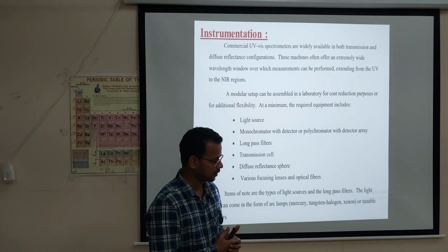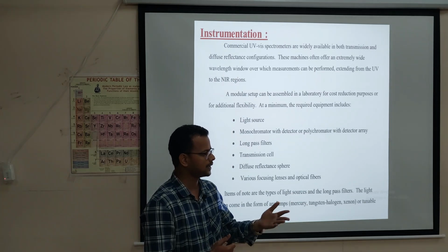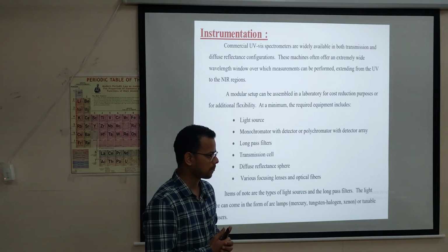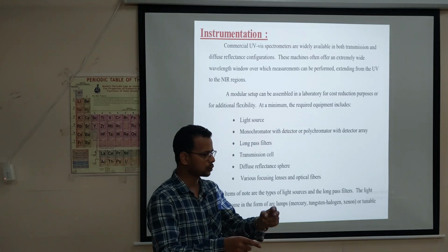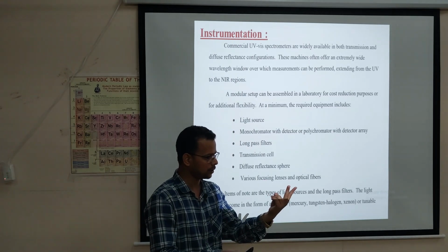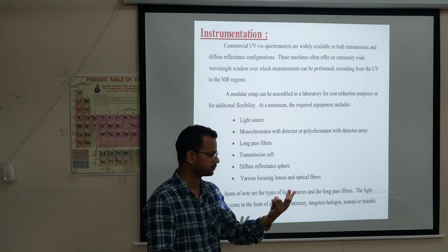For solid samples, we can do qualitative measurement: what is the band gap? Here in the instrument we have only two sample holders, one for liquid samples and one for solid samples.